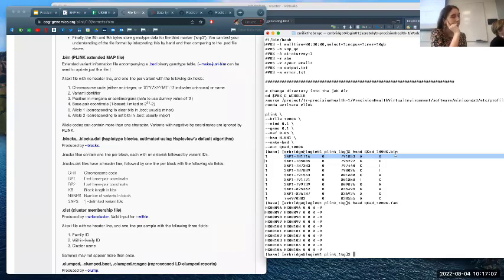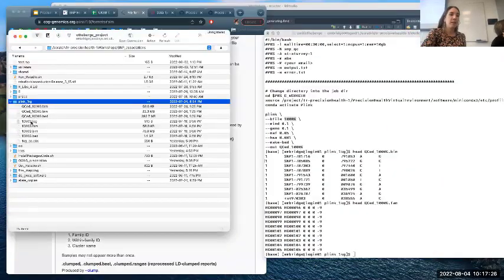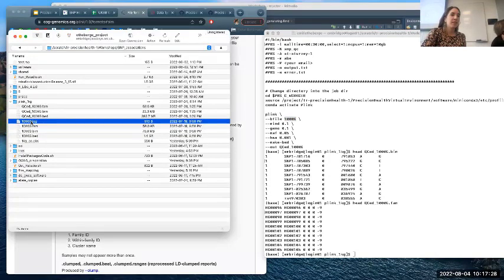Okay. I have another couple questions for this PLINK. Once we see the PLINK run, it has so many parameters to be set, but it didn't have the name of the input file. So is this input file all the files within this working directory? The input file is 1000G. As you can see, that's here. So it's all kind of nested in here.